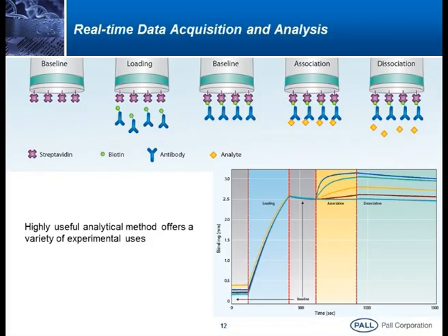Giving an example here, one of the sensors is a streptavidin coated sensor. The matrix is streptavidin here. I am immobilizing an antibody which is biotinylated, and if you look, there is a response like this. The sensor just has a baseline. When I dip the sensor into the corresponding biotinylated antibody, you see the gradual rise in that.